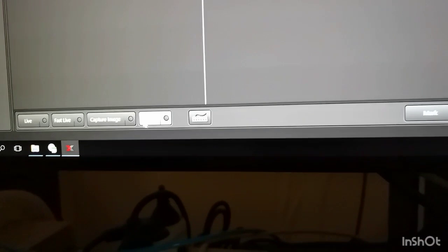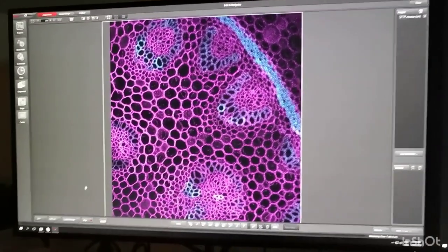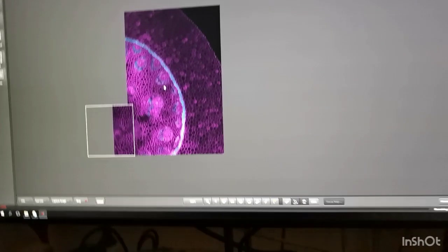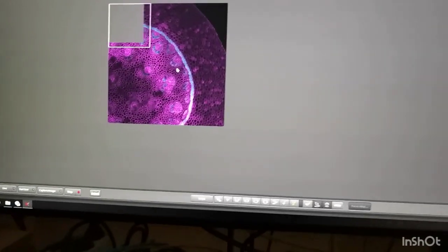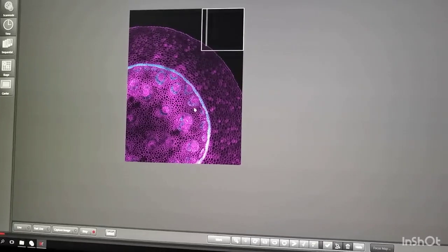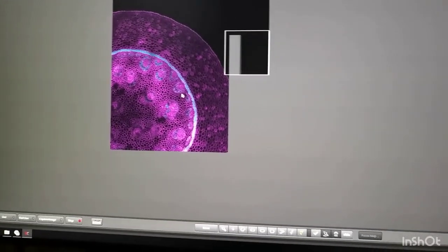It opens up a new window, and there's a spiral scan at the very bottom. If you press the spiral, then it starts from the frame that you were in, and then just makes a spiral around to see all the edges of the sample. It scans the whole area until you press stop.